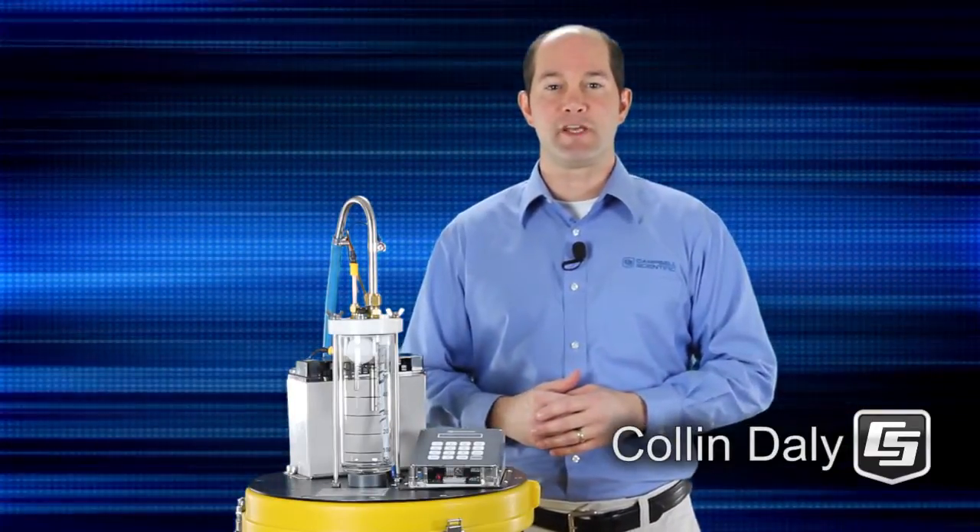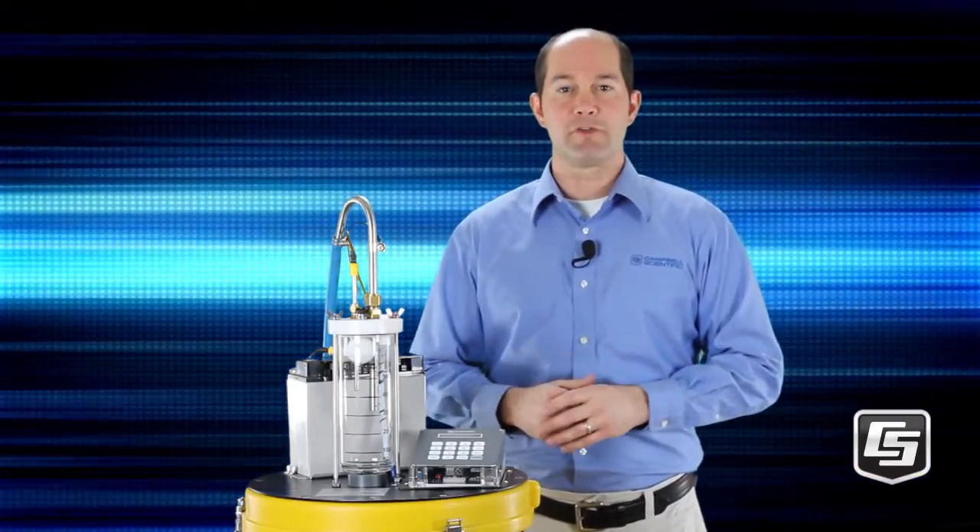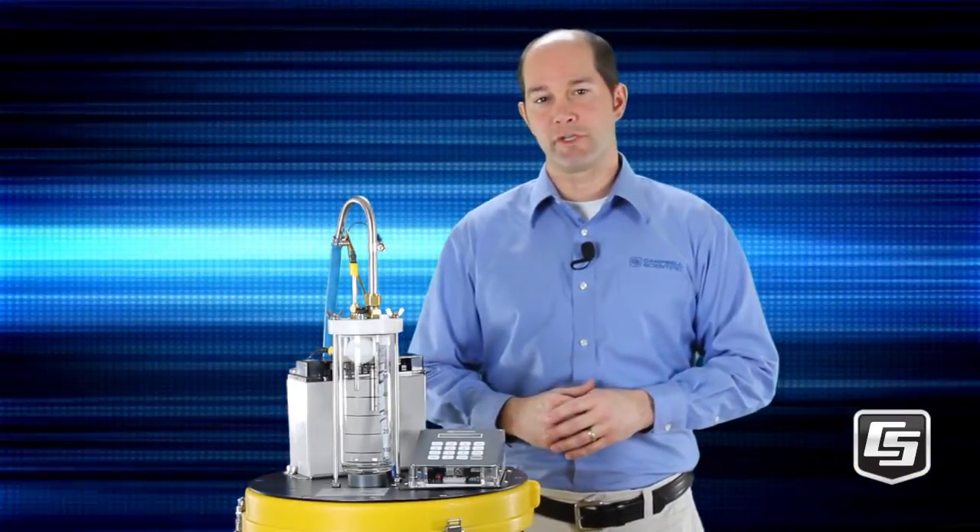I'm Colin Daly of Campbell Scientific in Logan, Utah. In this video, we'll show you how vacuum technology works in our water samplers.